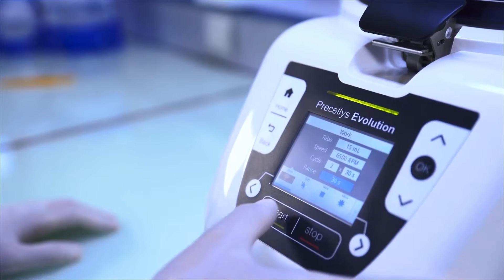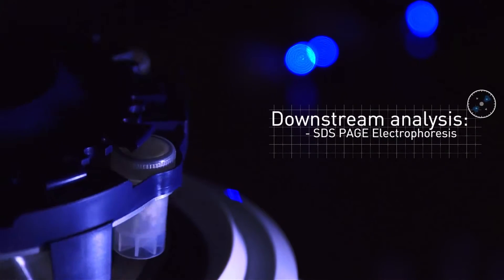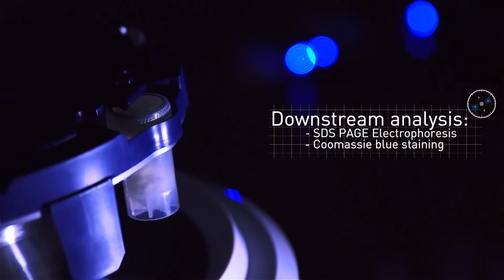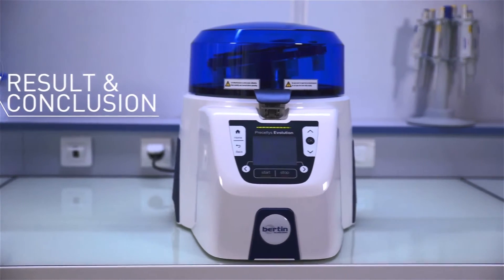The protein extracts are loaded on a 12% polyacrylamide gel and are separated using SDS-PAGE electrophoresis, followed by Coomassie blue staining. After Coomassie blue staining, the cashew nut protein profiles are clearly seen.